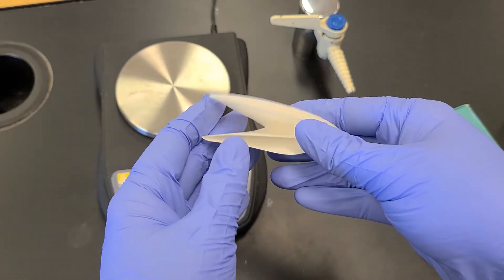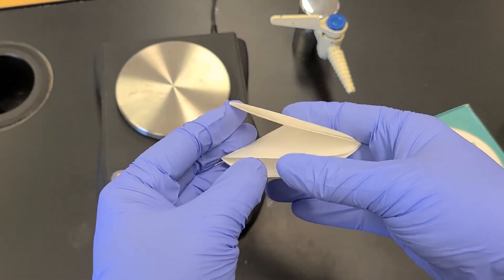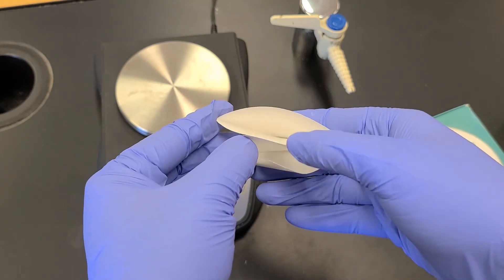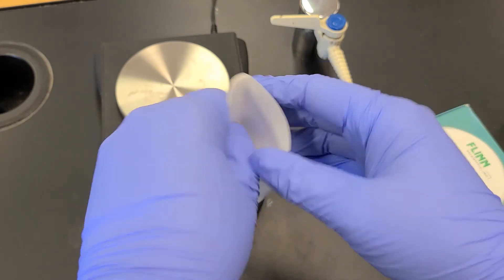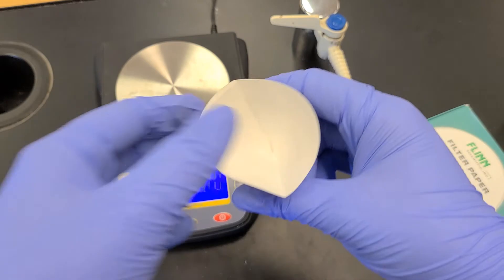Whenever I insert this into the funnel, I'm going to grab three of those layers and push open the fourth so that I get a nice little funnel.